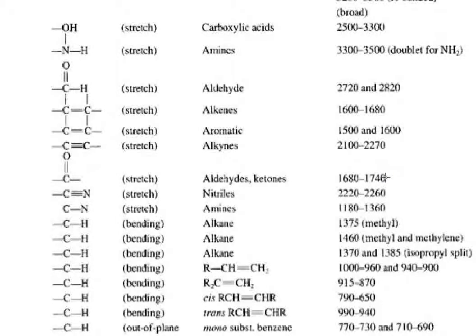It's not all that broad, it's somewhat narrow, but a very big peak. And you find it at a characteristic region. There isn't much else in this region from 1680 to 1740. Now this carbonyl stretch for different functional groups, and there's a lot that are possible, can be a little lower than 1680, or a little higher than 1740. Next we come to a carbon-nitrogen triple bond stretch. We're all still in the stretching bonds. That's called the nitrile group, and the average stretching frequency of the nitrile is around 2220 to 2260.